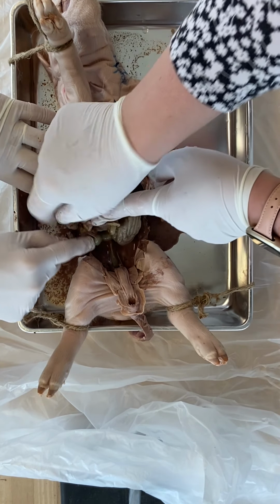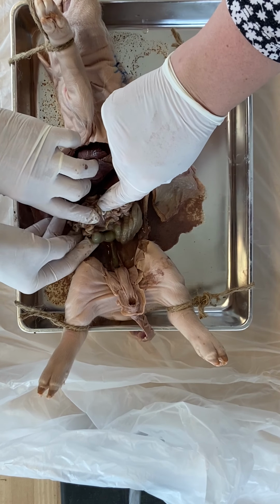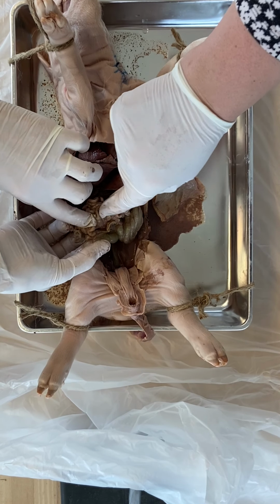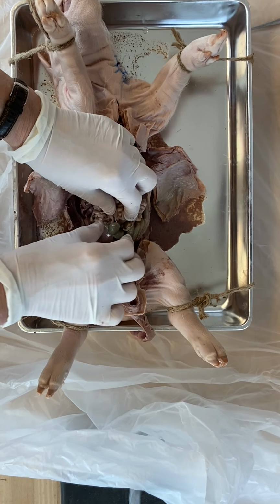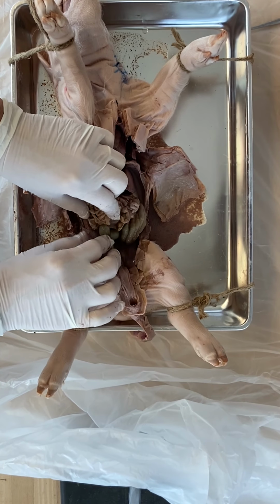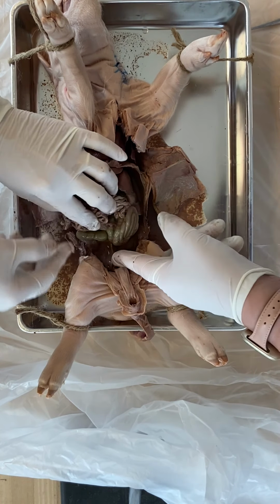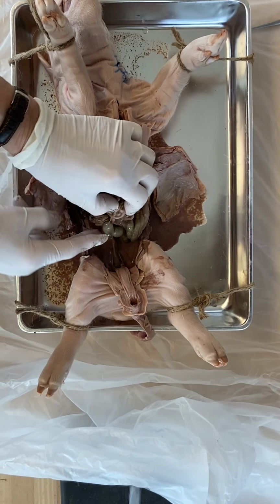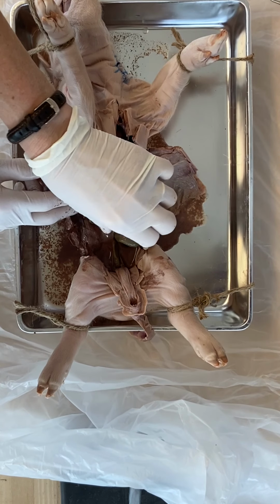Right there is where it joins into the large. Quite a defined join. And if this was us, there would be an appendix here. I was going to say, do pigs have an appendix? I don't see any indication of an appendix. Maybe it's down lower. Where did it first enter into the large intestine?